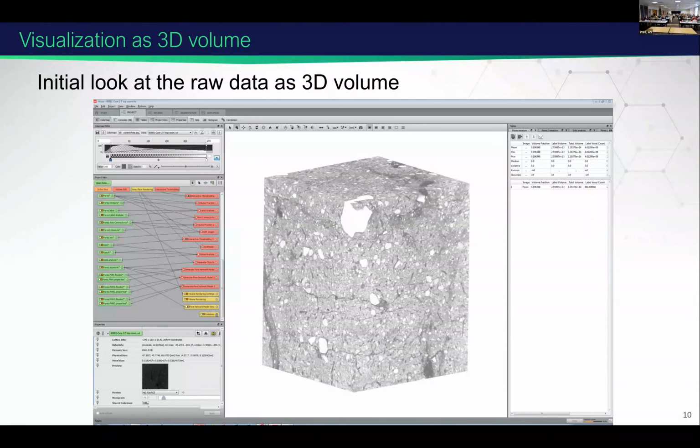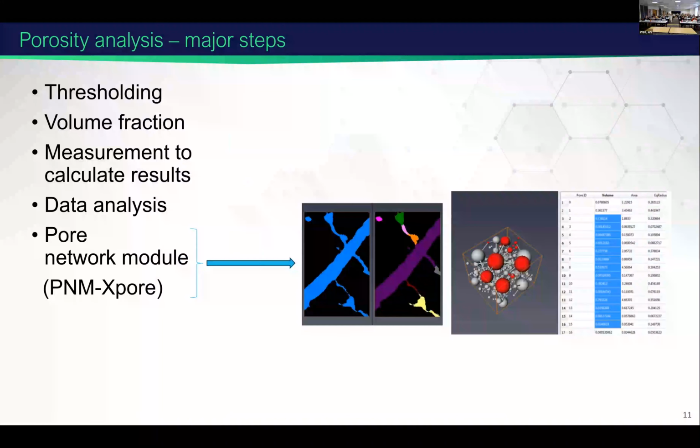This is the same data set that I'm showing in a 3D view, or we can call it an isometric view as well. Here we can clearly see this is the cropped volume, and we can clearly see the cracks and the pores and the organic and high density particles. There are also some root things that are really hard to segment, which I will tell you about later.